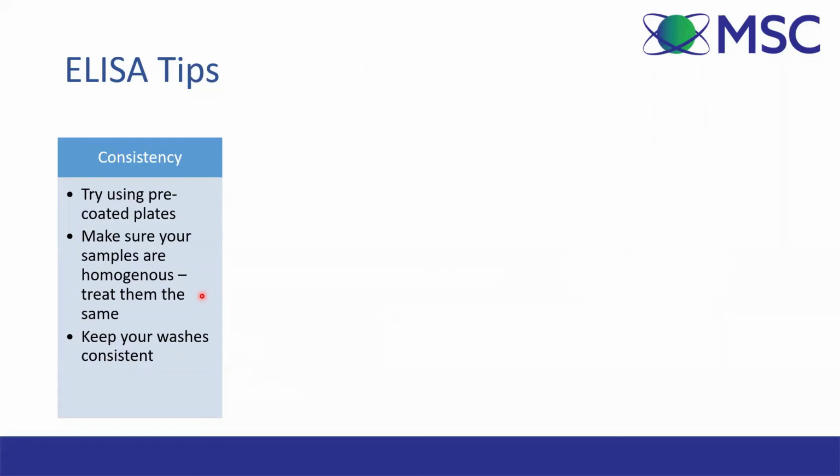Another one is to make sure your samples are homogeneous. So this means keep them the same. And also try to keep your washes consistent.